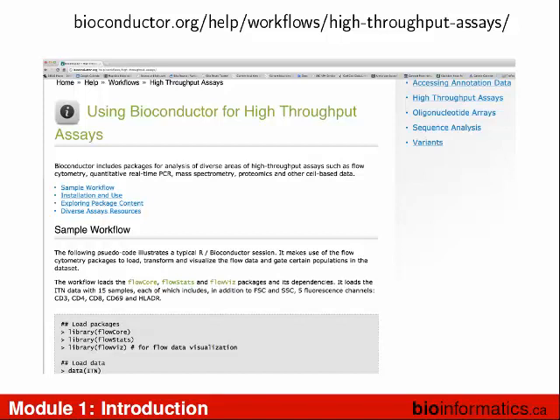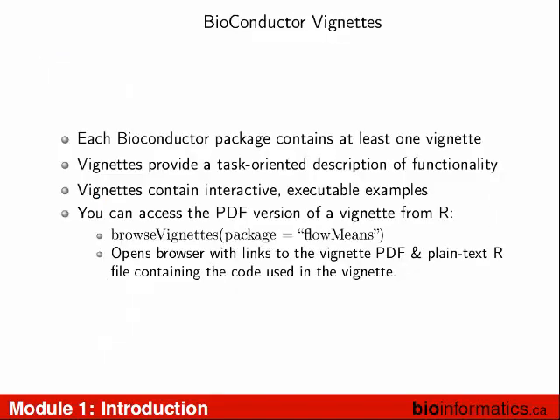They're available online. So I described the vignettes. All the packages have one. They describe the basic functionality. They're interactive. So it's some of the really cool things that you can do in R, for example, is you can write some code that actually writes your paper. And all the code in there will generate a PDF. And this is how all the vignettes are done. The PDFs are actually generated by the code that is written.